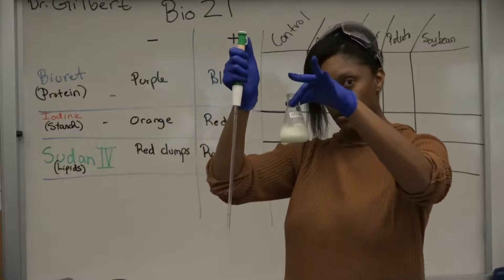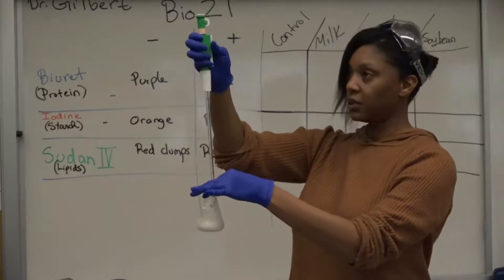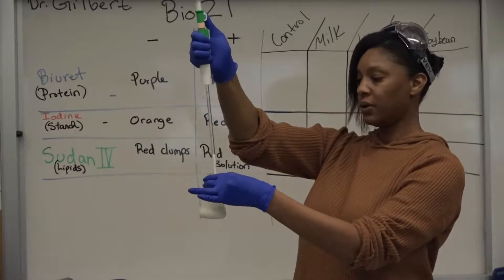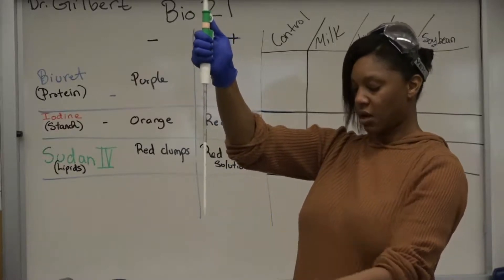So here's our milk homogenate. We'll start in there. I draw my plunger up. And you can see the milk? We're going to use it up.